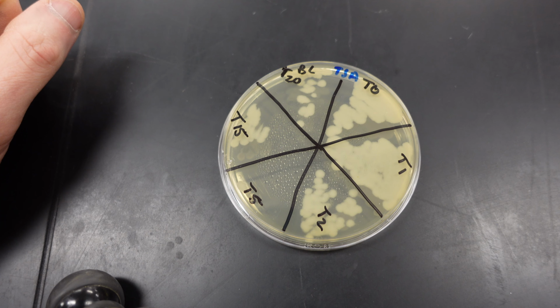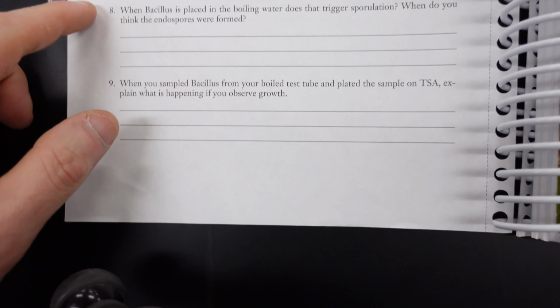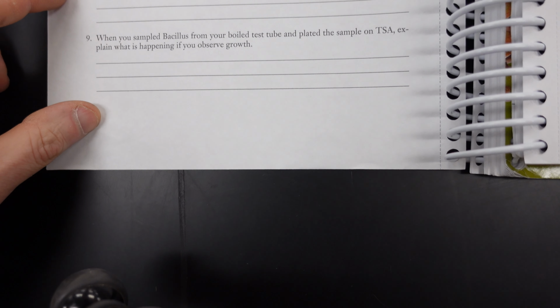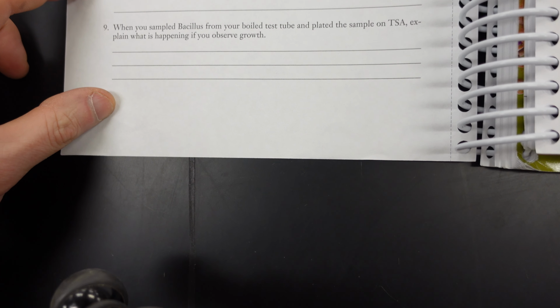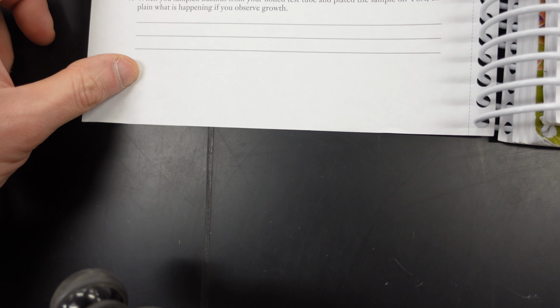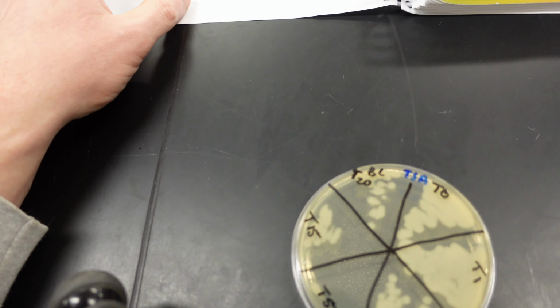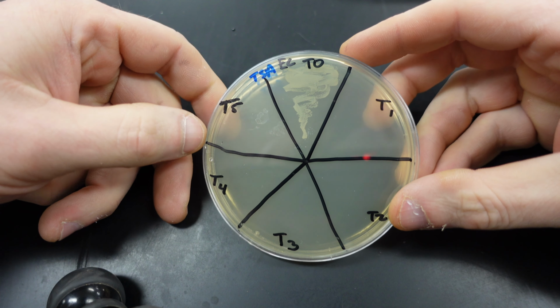So question number 8 in the lab report: when Bacillus is placed in the boiling water, does that trigger sporulation? When do you think the endospores were formed? And again, think how long the sporulation process is and what causes bacteria that can form endospores to actually form the endospores.